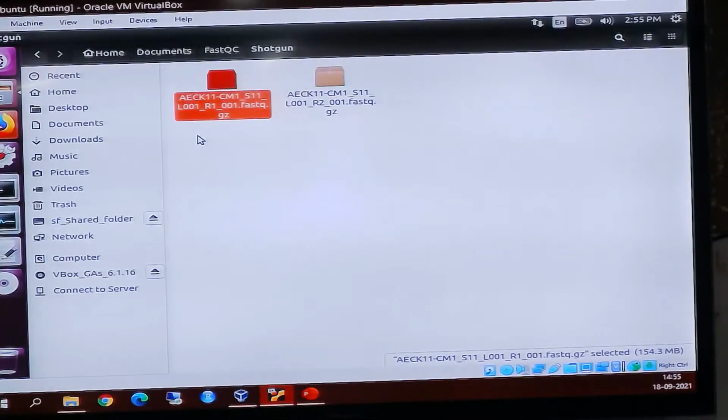Say someone has used k-mer 33, someone has used size 71. So try to share your results in order to get an idea of how the assembly differs with different k-mer sizes, right? Another suggestion I would like to make is that the data which I have provided you is quite large, so it is possible that you will take more time to complete that task.